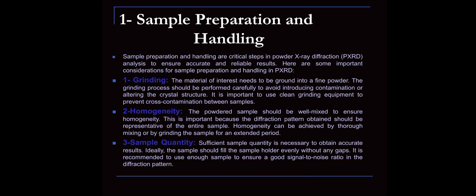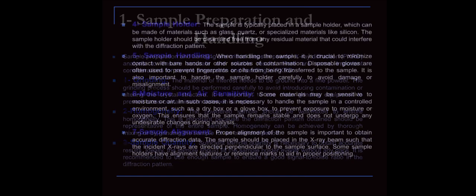Third one, sample quantity. Sufficient sample quantity is necessary to obtain accurate results. Ideally, the sample should fill the sample holder evenly without any gaps. It is recommended to use enough sample to ensure a good signal to noise ratio in the diffraction pattern.